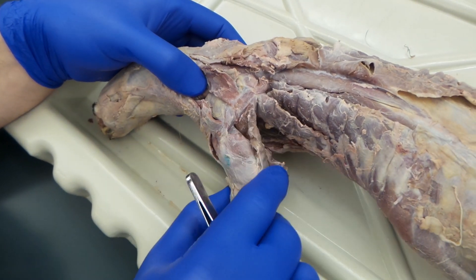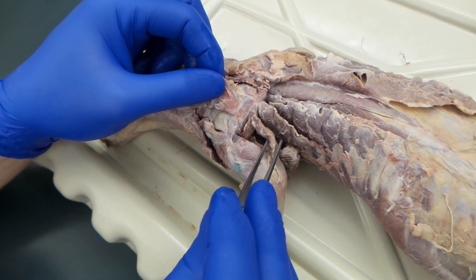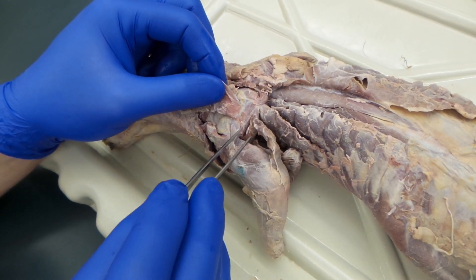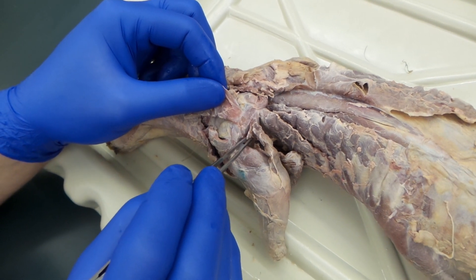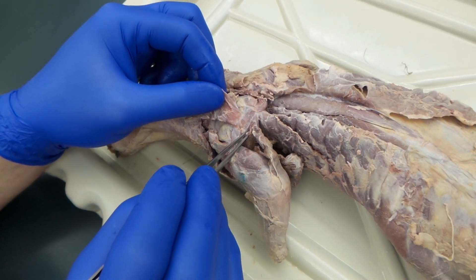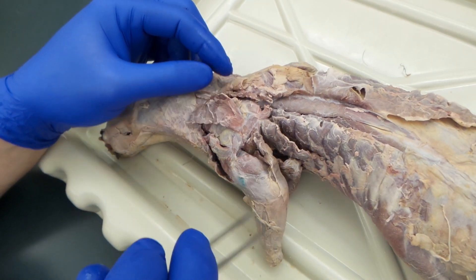Move your acromial and your spinotrapezius back over, and right there, that is your infraspinatus. Pull the arm a smidge — we're also looking at the epitrochlearis for exam 2. But when you pull on it, you can see this little guy: that's infraspinatus. This is teres major. Teres major kind of comes up and points right at your rhomboideus major.